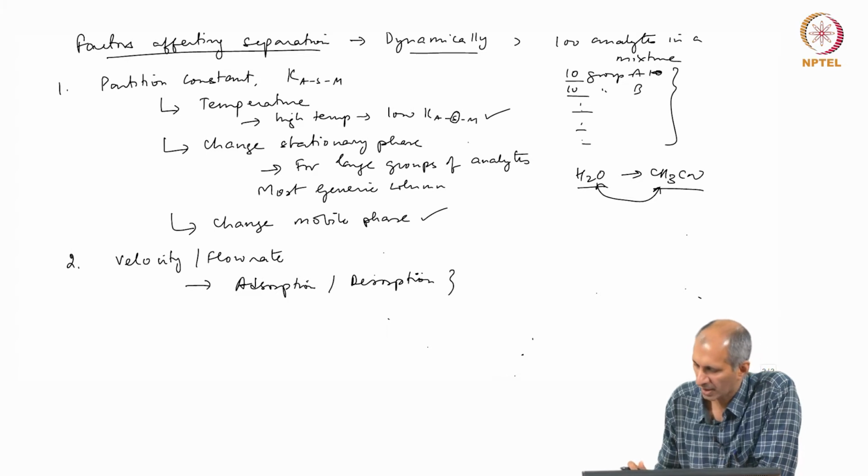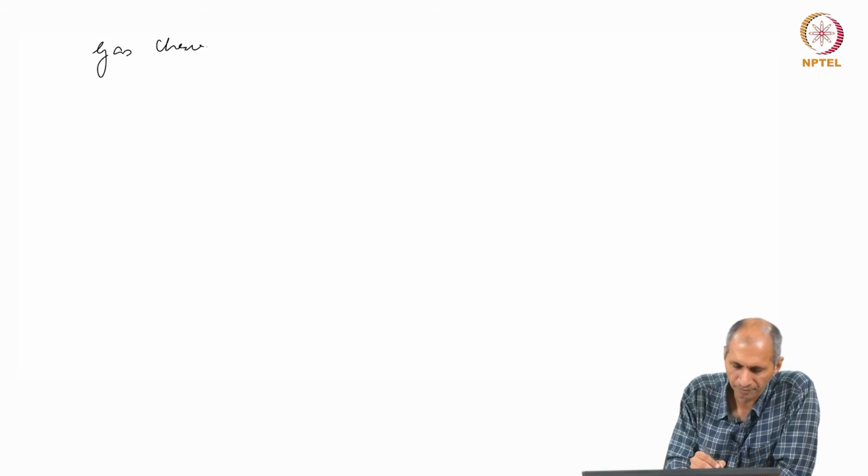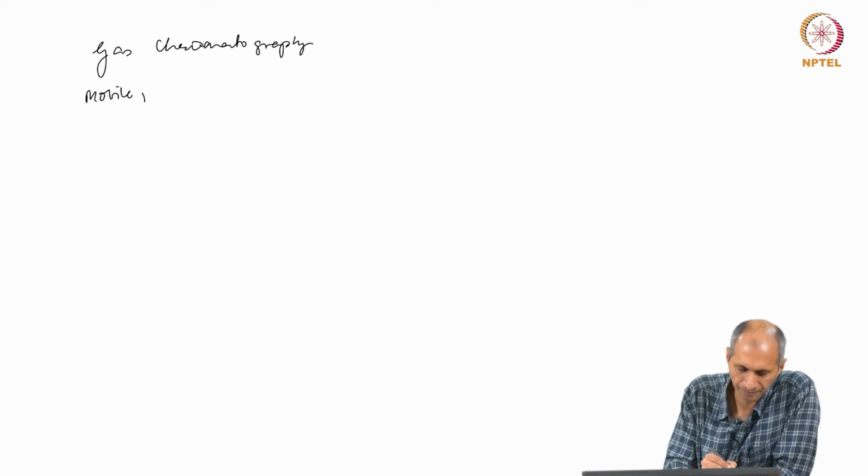Okay. So, last class we were discussing mainly gas chromatography. In gas chromatography, the mobile phase is a gas.